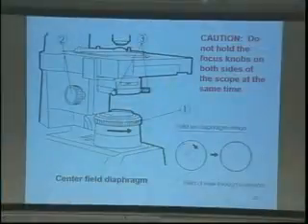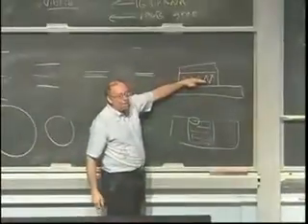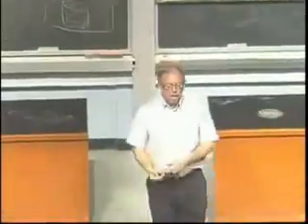We want to set the best lighting possible. It's called Köhler illumination. That means we have the right amount of light, not too much, not too little, and we position the focal point of the light source right on that specimen, ideally. So there's a series of steps you'll do to do that. It's called setting Köhler illumination. You run through those steps.